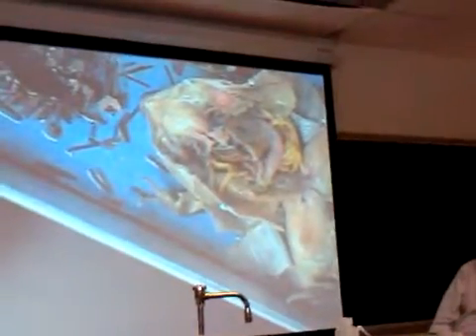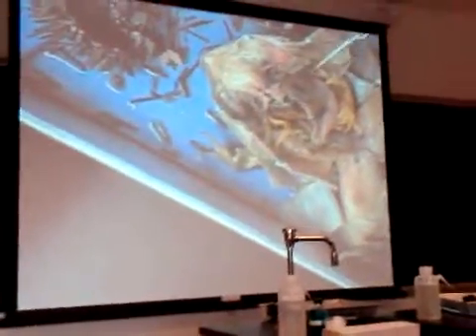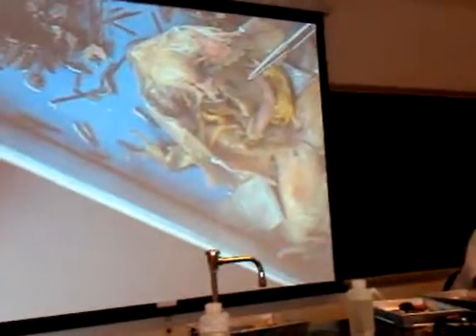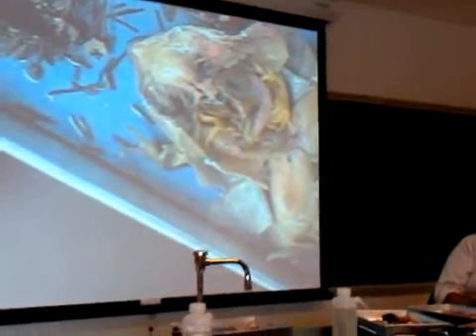Sharks are primitive fish, and fetal pigs are somewhat undeveloped in some areas, and so the frog is a good dissection. Okay. The largest abdominal organ, right? Lobes of the liver. So here's a lobe, there's a lobe, and there's a lobe, right? Liver. Pay attention because we're going to quiz you.